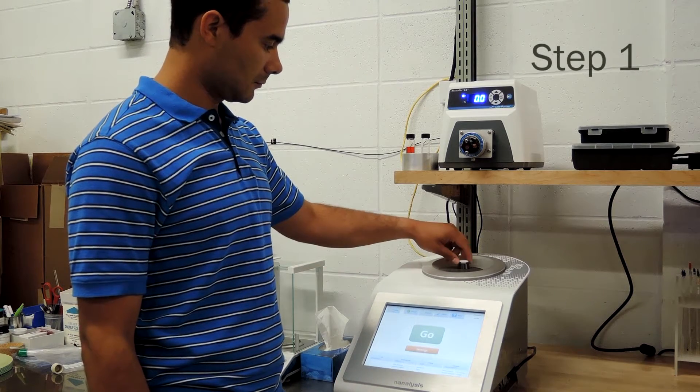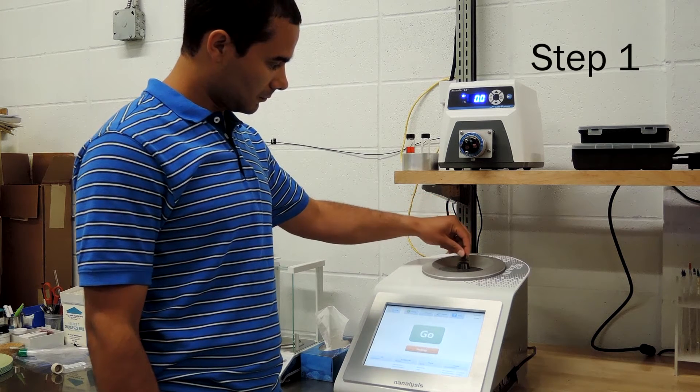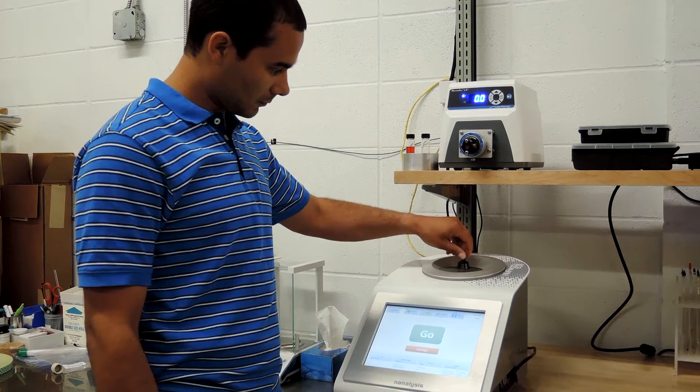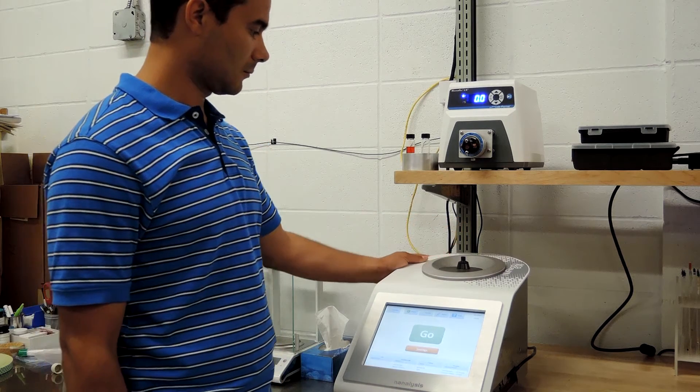We start off by removing the white cap on top of the spectrometer by unscrewing it. Replace it by screwing in the longer black adapter that came with the flow kit. This provides more support to the flow cell and helps prevent it from being accidentally broken.